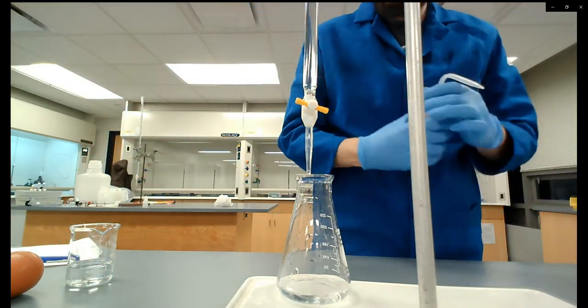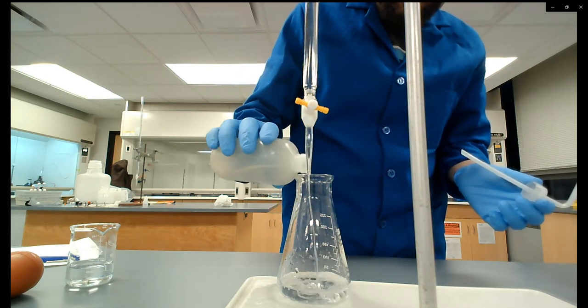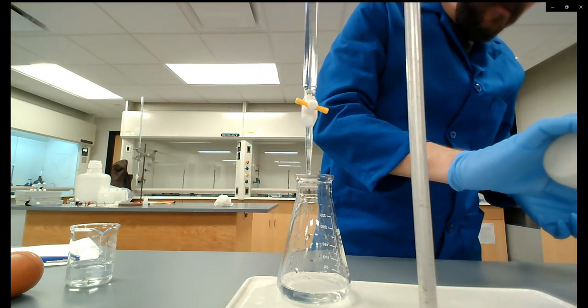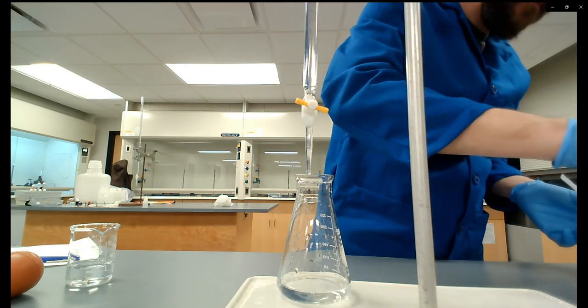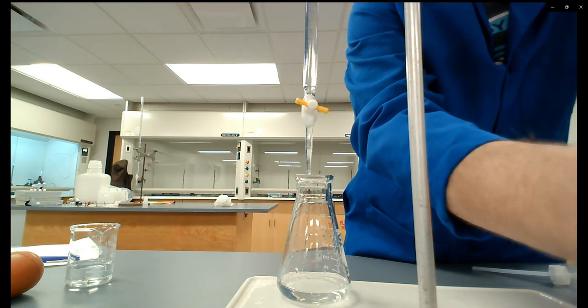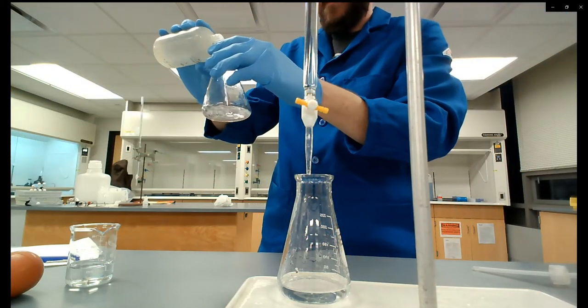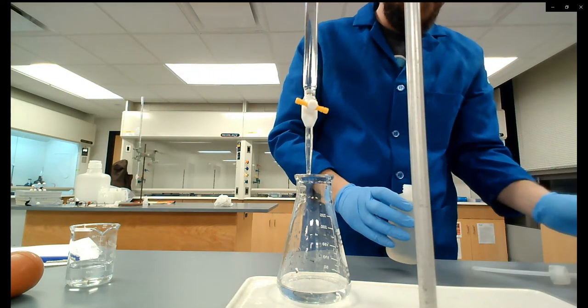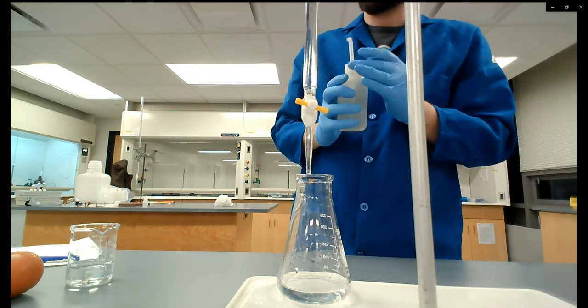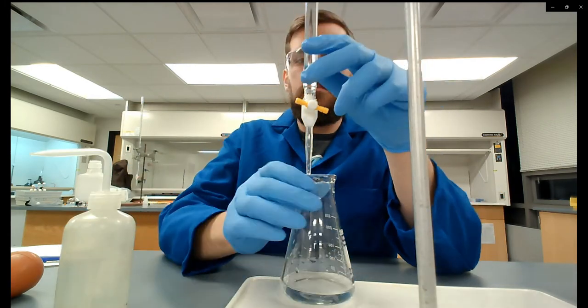I'm adding a bit of water to each flask because the Erlenmeyer flasks I'm using are pretty large and 10 milliliters barely covers the bottom. I want enough liquid to get a good swirling motion, so I'm adding some DI water to give maybe a quarter to half inch of depth to the solution. Now we are ready to go.